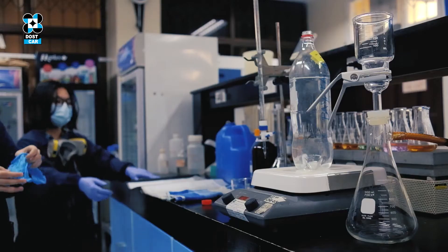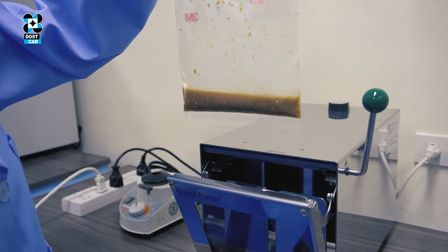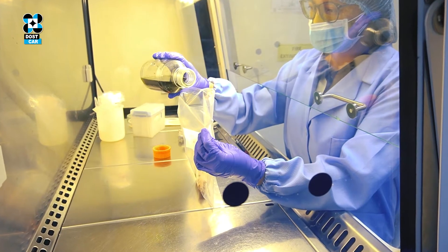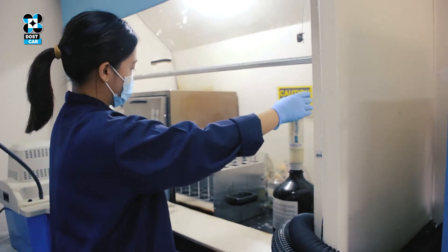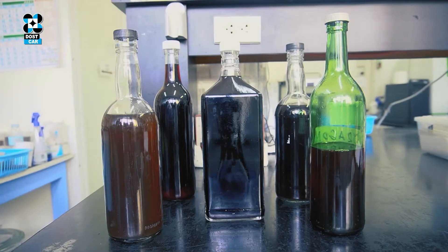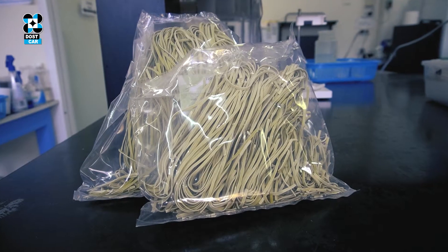Further, the RSTL is the only laboratory in the region accredited by the Food and Drug Administration as a food testing laboratory providing microbiological and chemical testing of food products and wines. This now includes shelf life testing of selected food products.